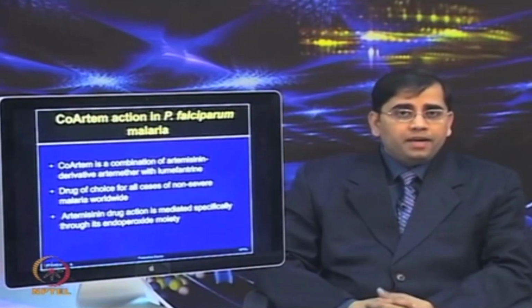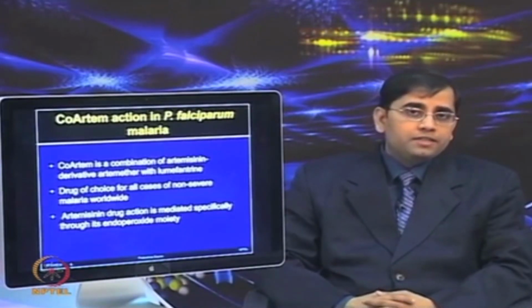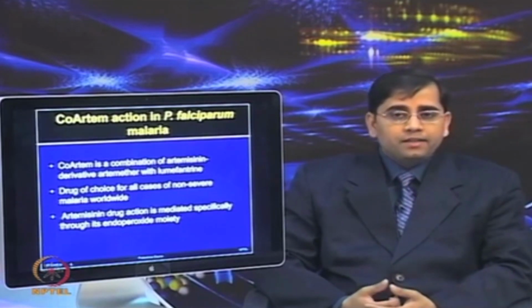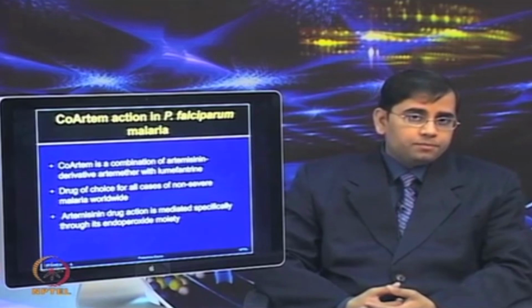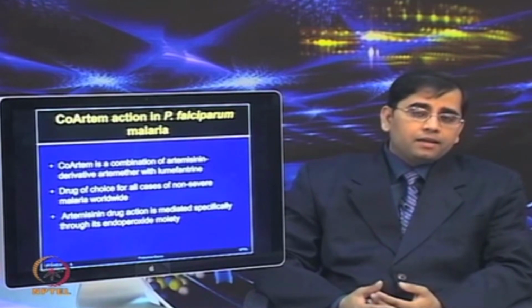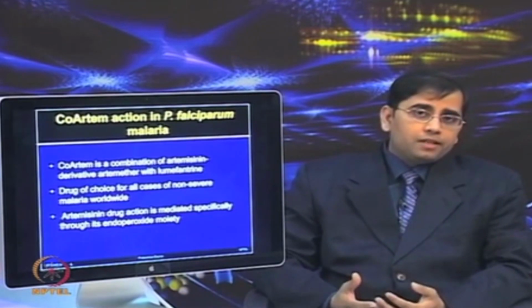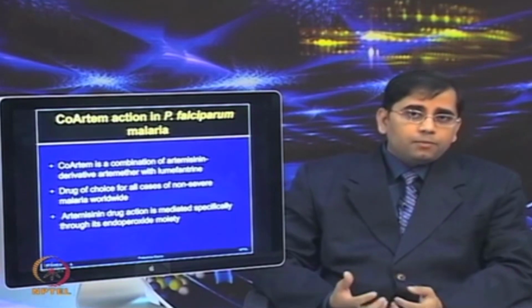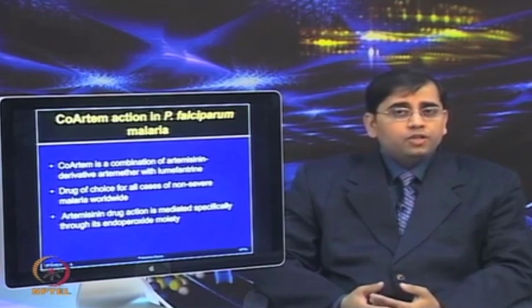How these two drugs behave and how the proteome changes occur due to the action of these two drugs were studied in this paper. So, authors applied proteomic approaches, the two-dimensional electrophoresis, to study the proteomic alteration of each of these drugs.